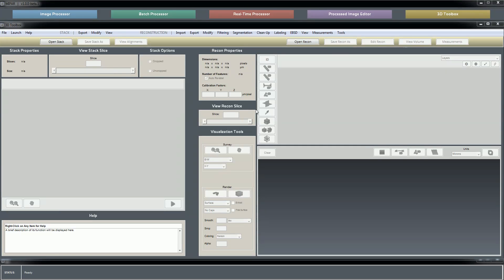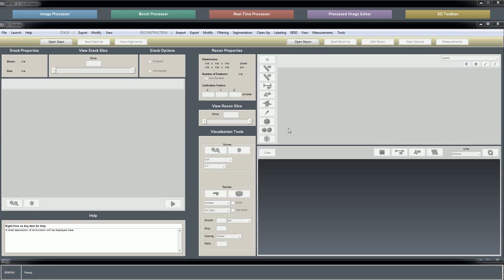So that, I think, about does it for the quick overview of the 3D toolbox. I know nothing has really been shown - we're just quickly going through an overview of the layout and some of the capabilities. But if you're interested in working in the 3D toolbox, if you're going to be using MIPAR for 3D analysis, then please feel free to check out the 3D toolbox tutorials.